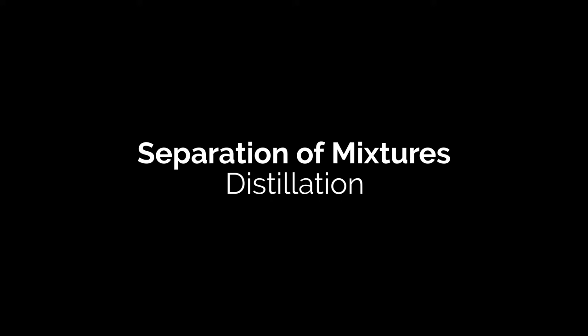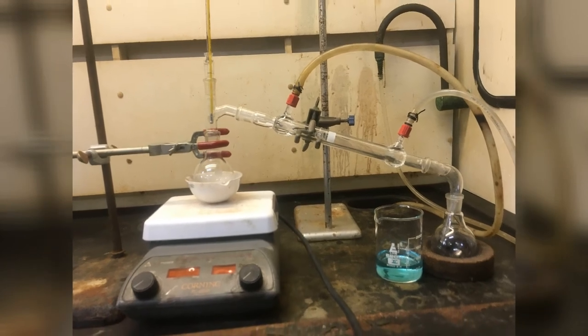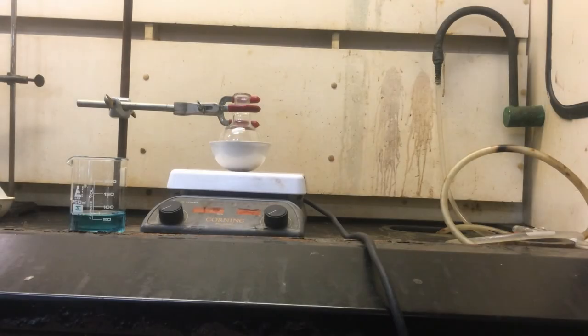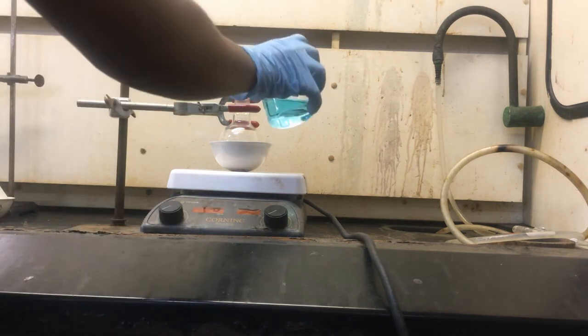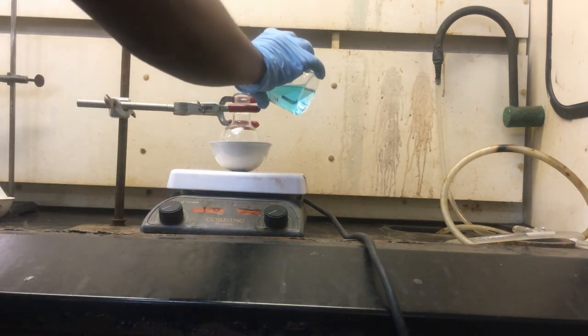Next we move on to distillation and of course this is a picture of the chemicals and glassware that we are working with. First we pour the copper to sulfate solution in a round bottom flask. We are the first round bottom flask.